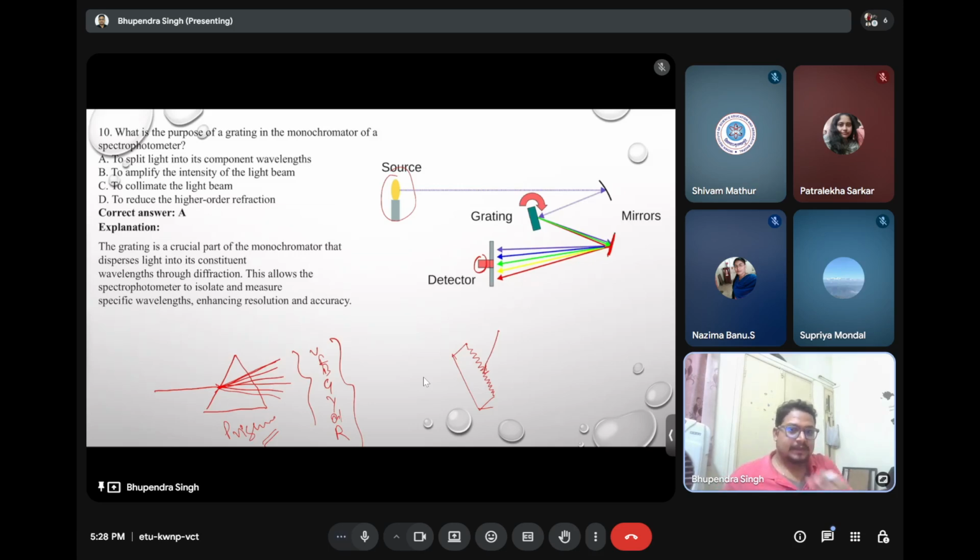Let's say 1 nanometer wavelength, and it keeps on scanning. Say you are given from 200 to 700 nanometer, and you want the absorption from this to this wavelength. At one point of time it scans 200 nanometer, then another second, 201, 202, like that. The pinhole is there, but the mirror or disk is changing. This is the instrumentation part, so only one light gets through. That is why this is important; otherwise it is very difficult.